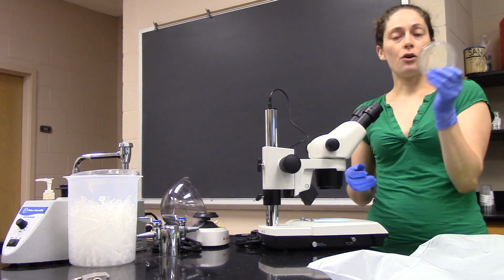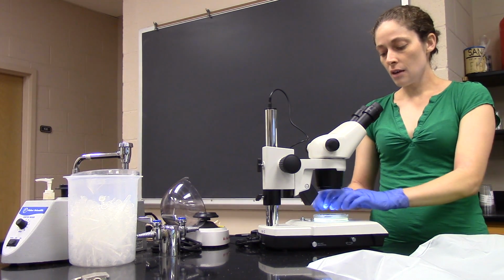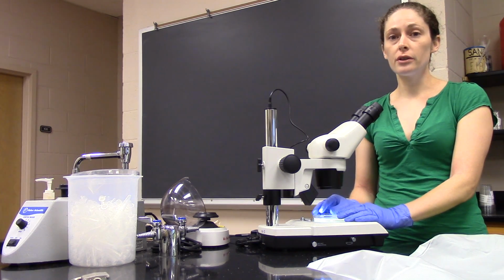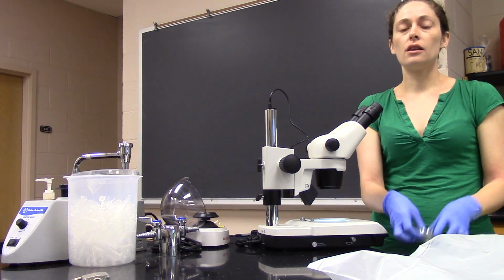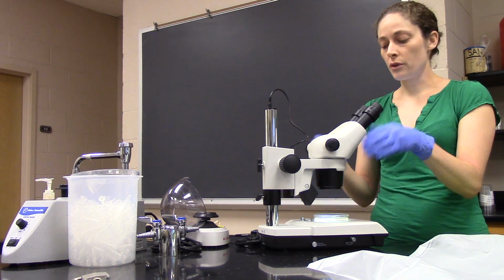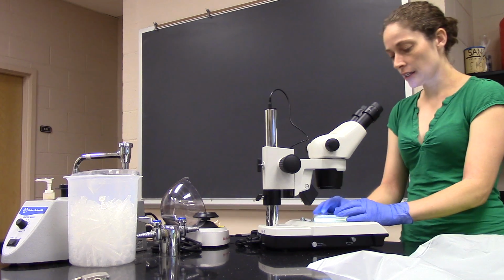Let's say I have only 10 worms on this plate and I don't know where they are. Well, anytime that I'm looking at one particular region, there may or may not actually be a worm for me to focus on. So it would be much easier if instead of looking at the plate I really care about, I took a different plate that I knew was just covered with worms all over and placed it on so that wherever I was looking, there would be something for me to focus on. Okay, so that's a handy trick.